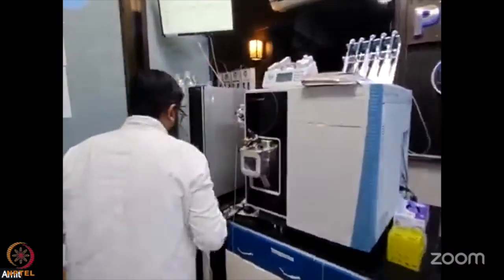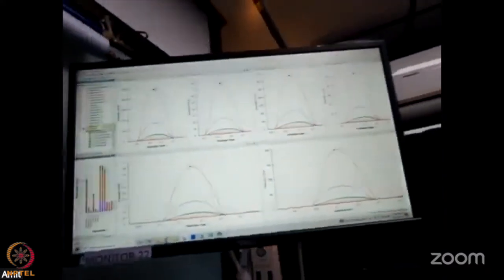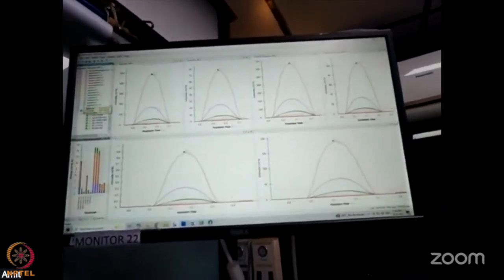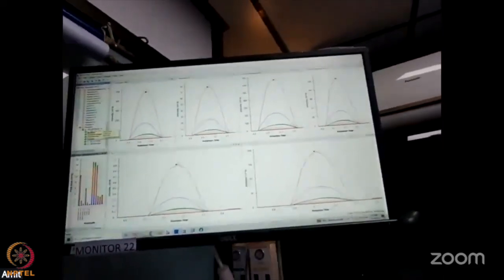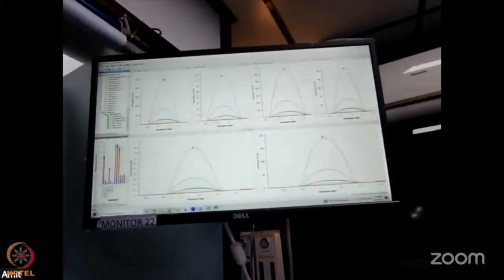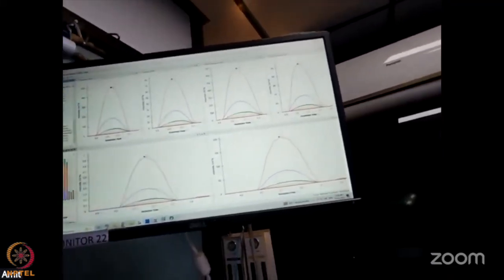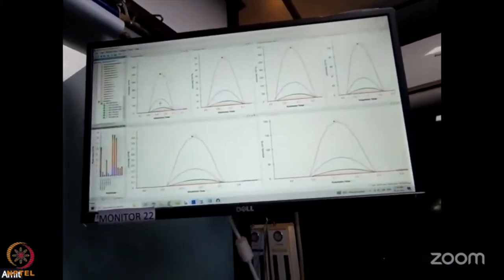I'll show you a quick overview of how it is generally done. I can show you for a molecule how we measure. This is done using the Skyline software. For example, this is one of the compounds. Here you can see the molecular weight, the m/z of the precursors, and these are the products. We instructed the instrument to capture each of these precursors and their products specific for this particular molecule, because it is a signature of this molecule.